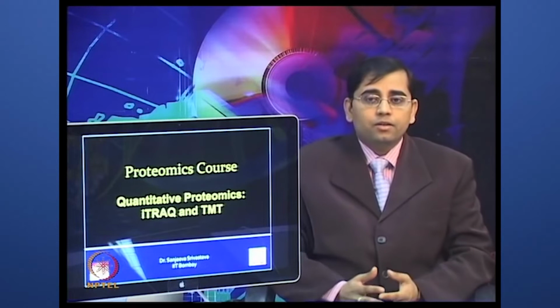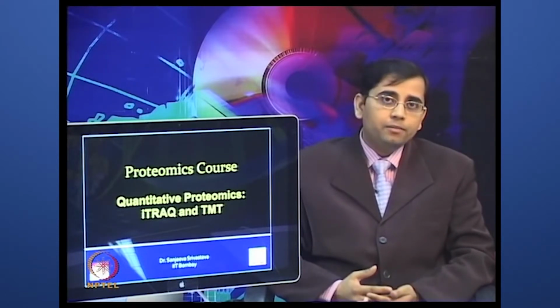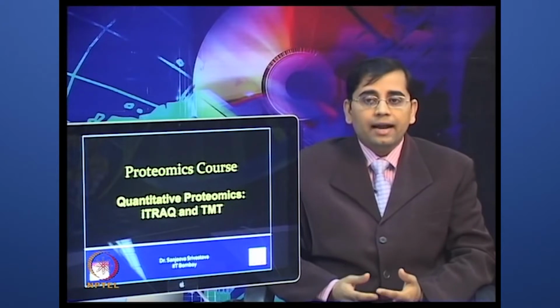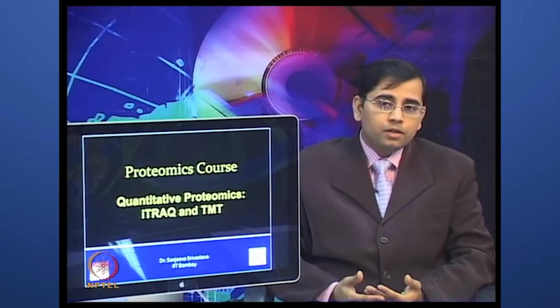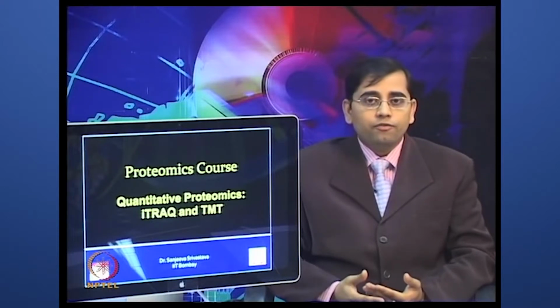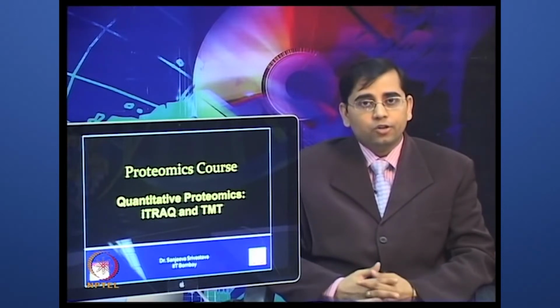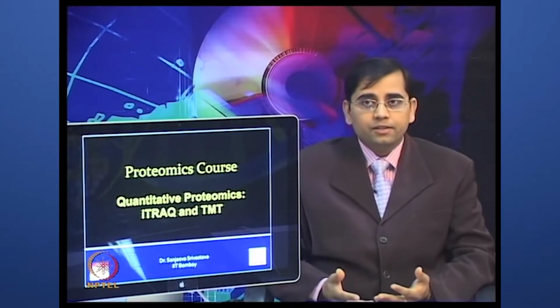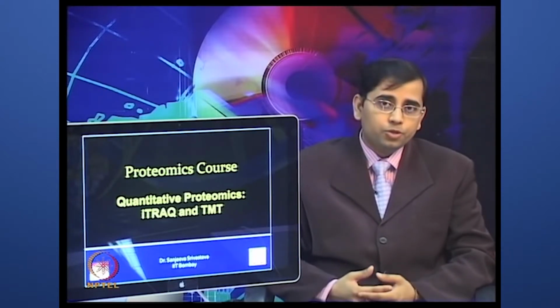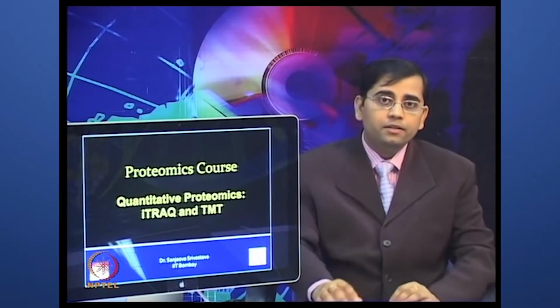These samples were combined, tryptic digested, affinity purified based on avidin, and then analyzed by the LC-MS based approach. So, the ion abundance ratio of light and heavy isotope labeled peptides could provide the relative abundance of these proteins.